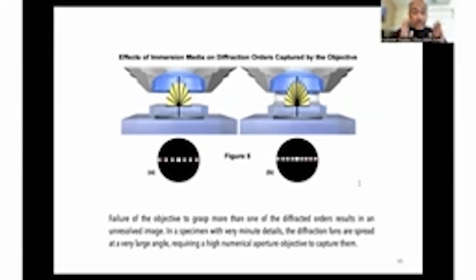And air has a certain diffraction. That is, the moment light comes through, the way the light distributes is different when the medium that is there between the objective and your sample is air, and that can be altered by using a medium that allows light to now make more light get into the objective.